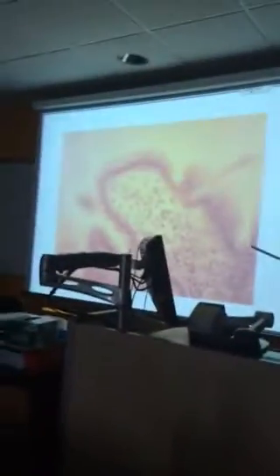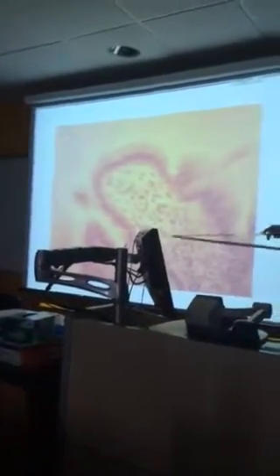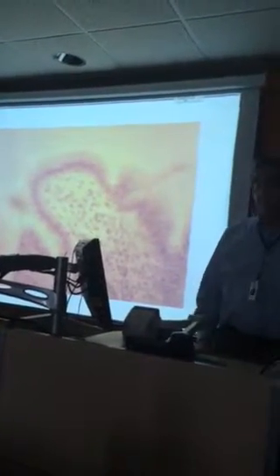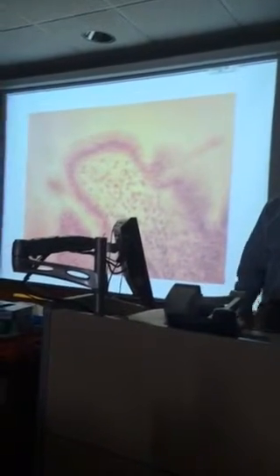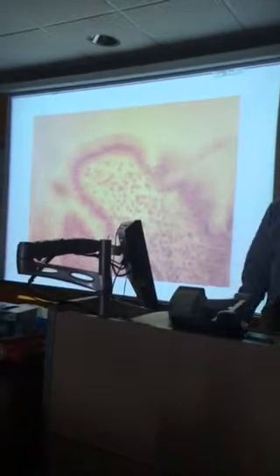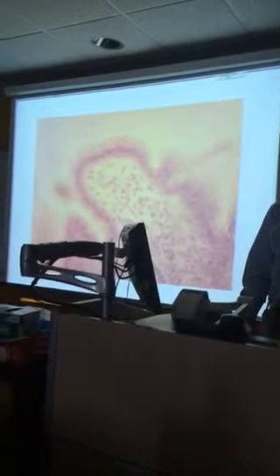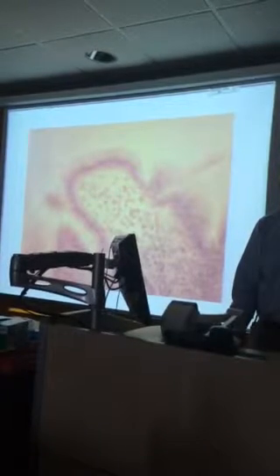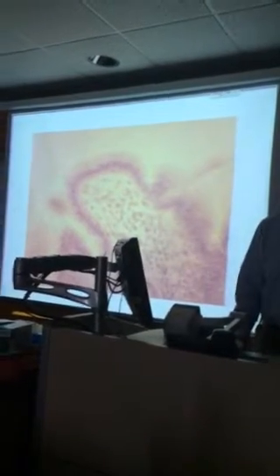Okay? And the connective tissue deep to the epithelium, remember this is a mucous membrane. What do we call this stuff? Remember we went over the wall last time? Elastic and loose connective? It's got a fancy name, two words. Submucosa? Lamina propria.